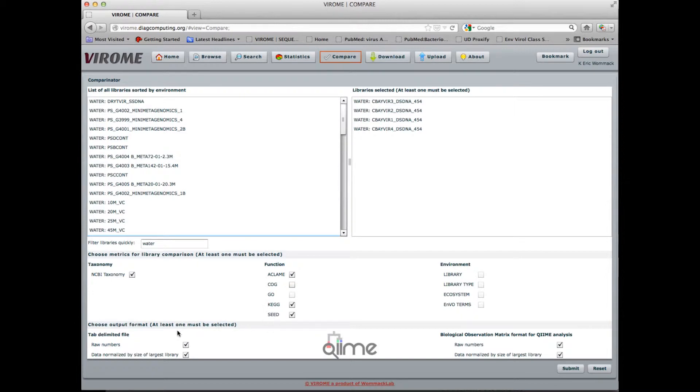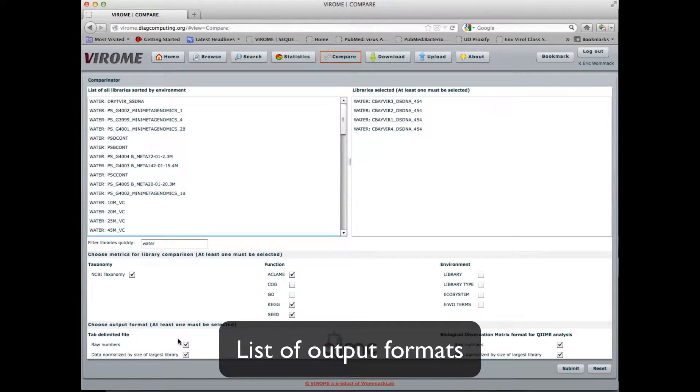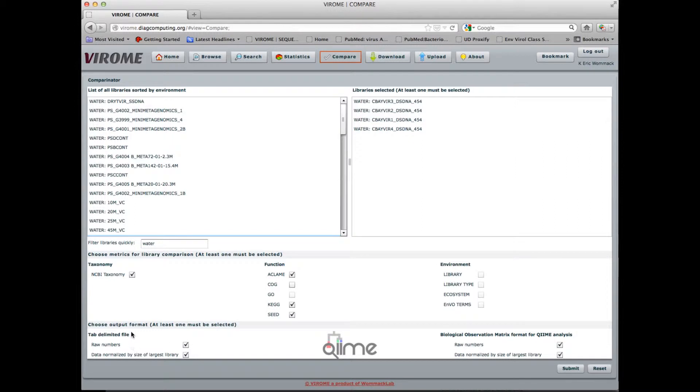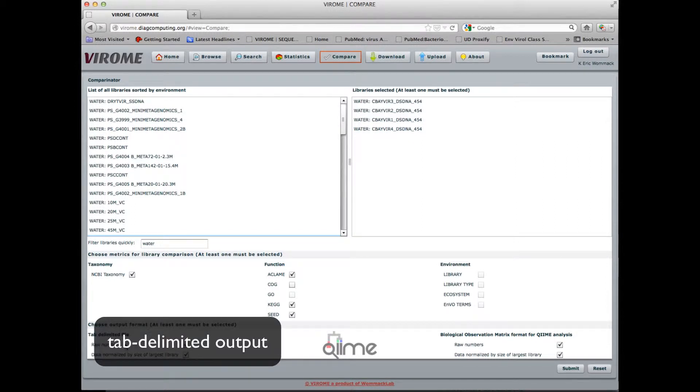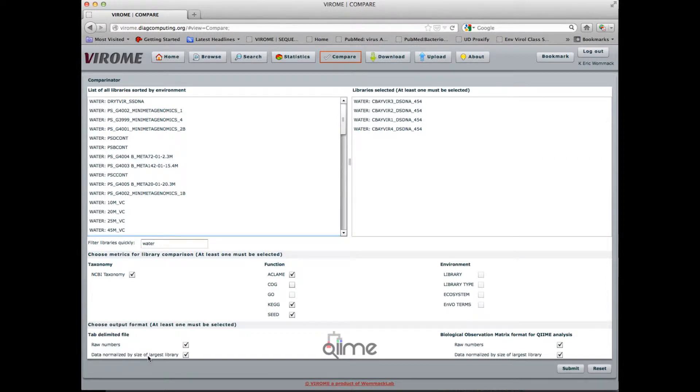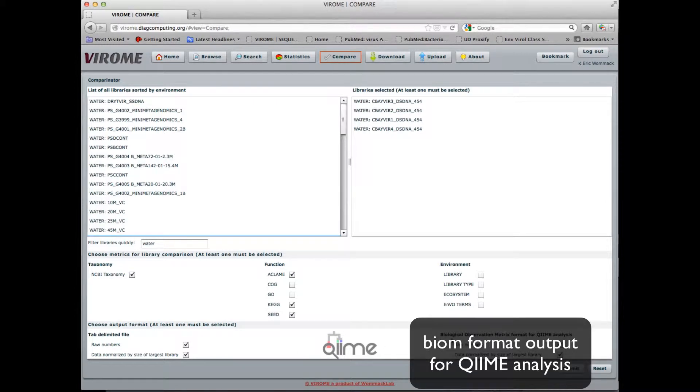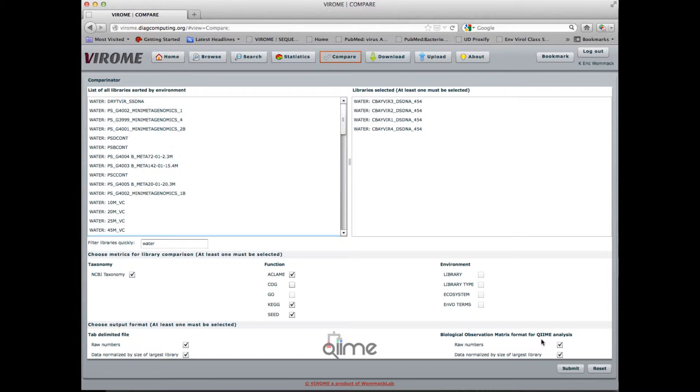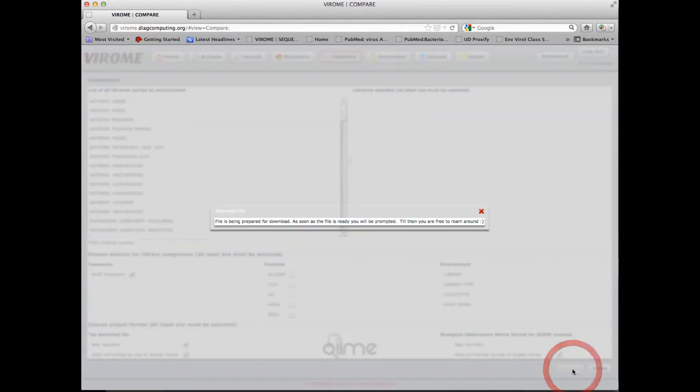And then the output format. So the default is that all output formats are selected, a tab-delimited file of raw numbers and data normalized to the size of the largest library, or a biological observation matrix format file which is suitable for input into the quantitative insights into microbial ecology package known as QIIME. I submit.